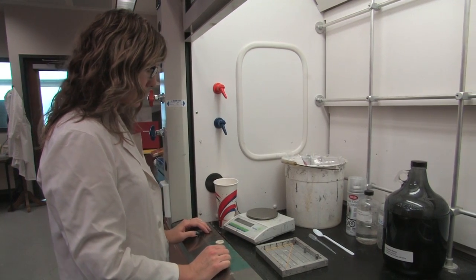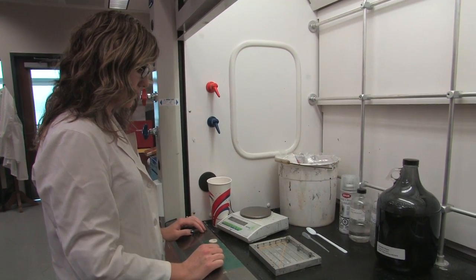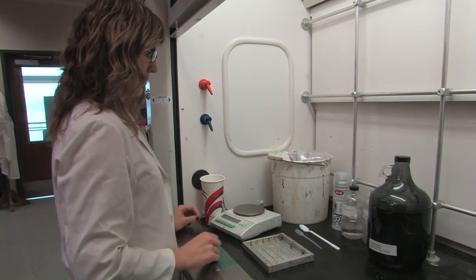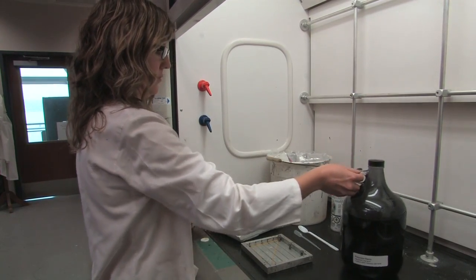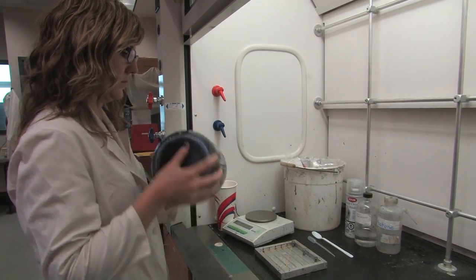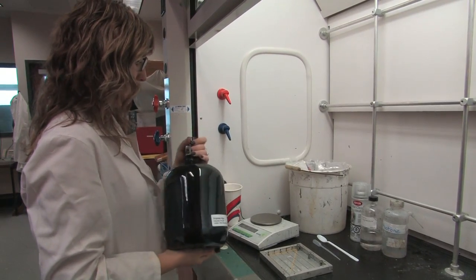Next, we measure out the epoxy and hardener. All pouring of epoxy resin is done under the fume hood. A solution of clear casting epoxy pigmented black with 100 milliliters of pigment has been premixed. Be sure to shake the epoxy to make sure the dye is distributed evenly.